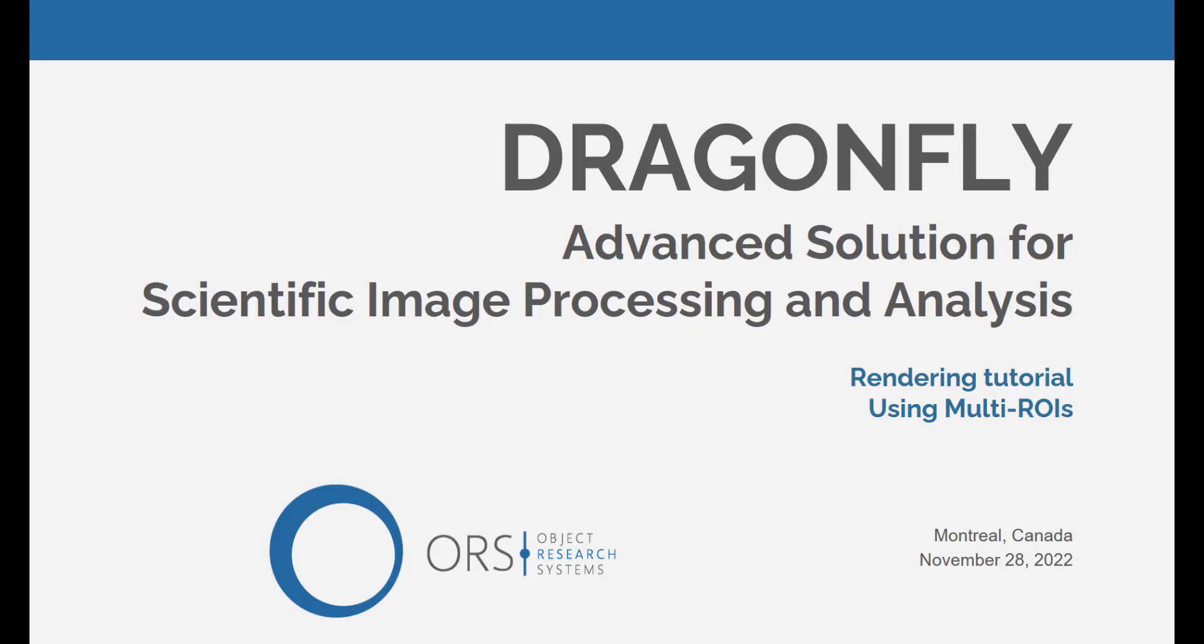Hi everyone, my name is Eric and this is another video to help you achieve your rendering and movie making goals with Dragonfly. Today we will talk about using multi-ROIs in your images and movies.